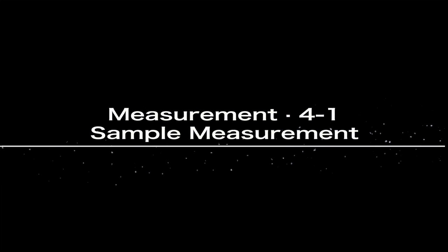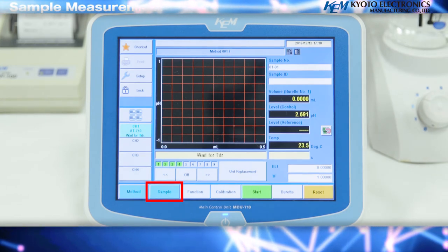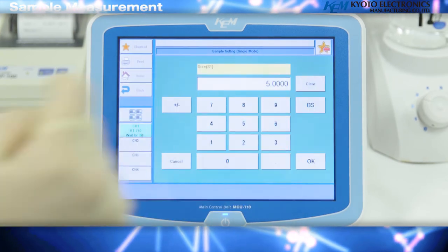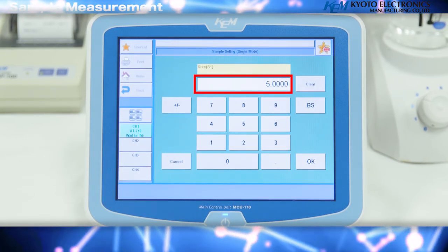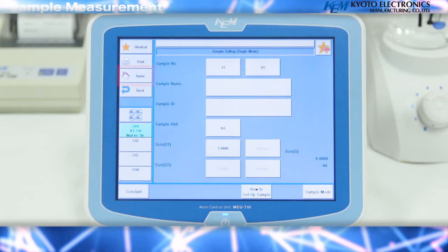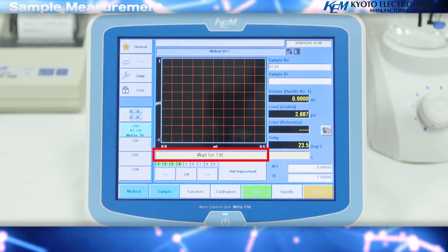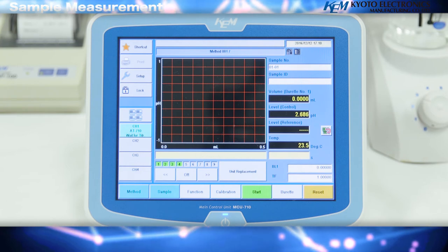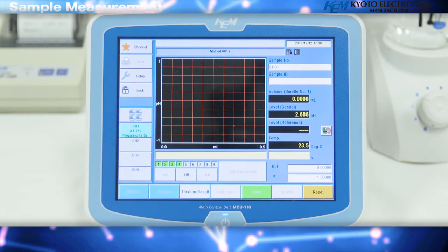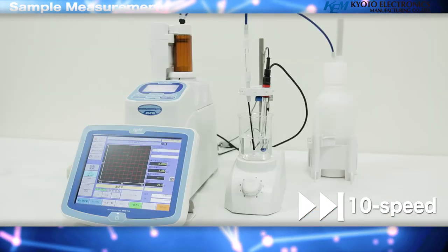Sample measurement: press the sample key, followed by the size S1 key. This time we will take 5 milliliters of the sample, so enter 5 mL and press OK. You can return to the home screen with the home key and confirm that the weight for titration is displayed. Begin titration with the start key. Titration preparation will be displayed and the measurement process will begin.